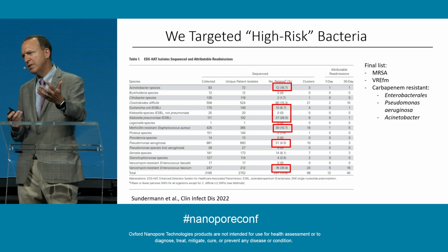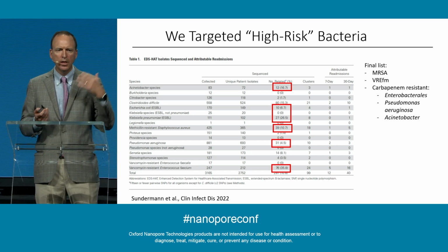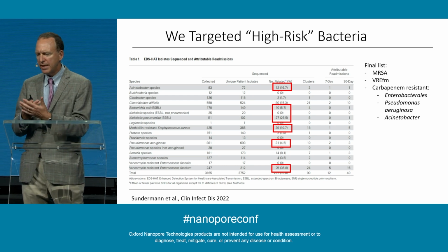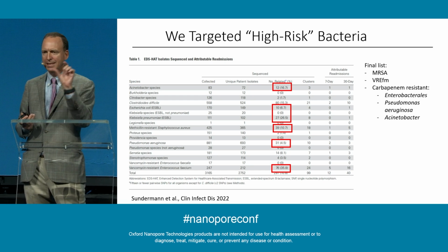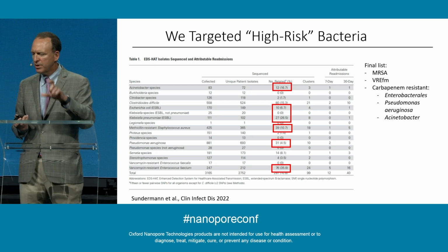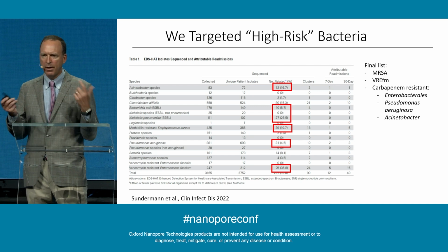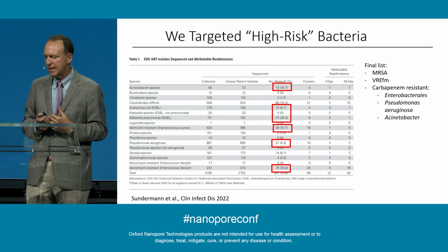They sequenced every single bacteria. That's really not feasible for one graduate student to do. So we went back to their paper and said, which of these strains are actually being transmitted? And again, I'm not going to delve too much into it, but there's certain strains where you'll see zeros next to them, like these strains are never transmitted in the hospital, and others that reach 10, 15%, like drug-resistant E. coli or vancomycin-resistant enterococci, which are typical organisms causing these kinds of infections.